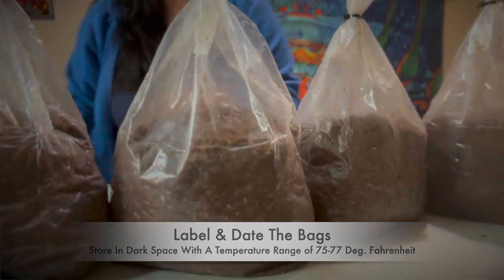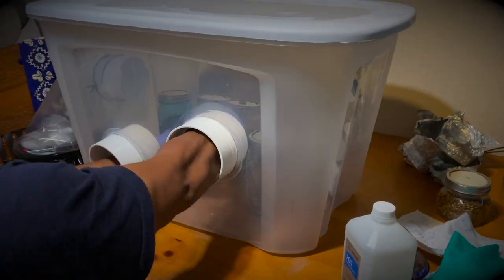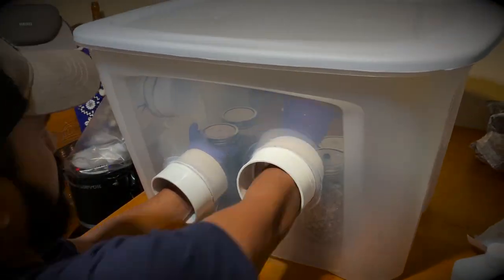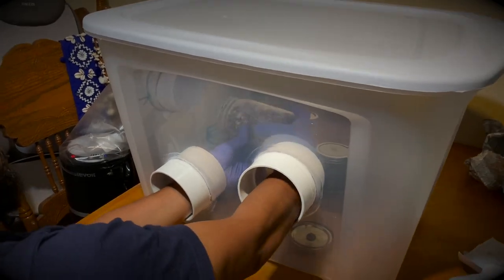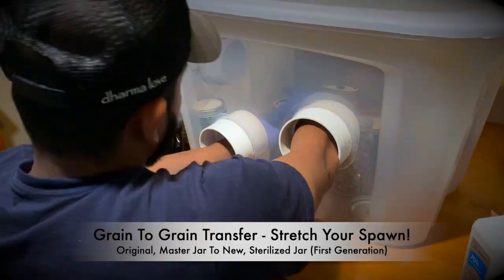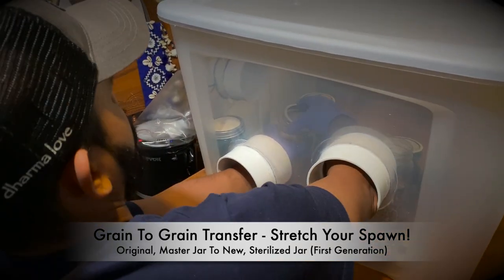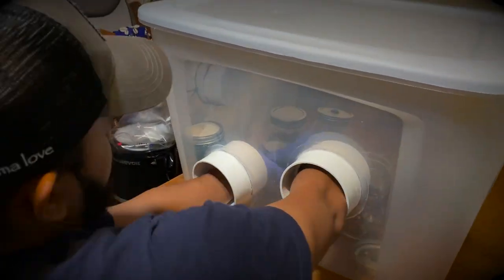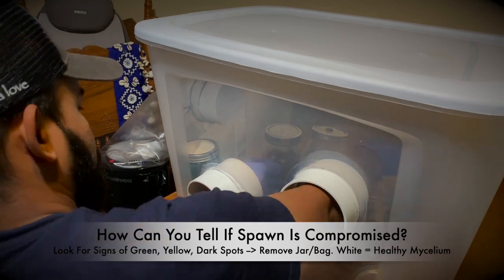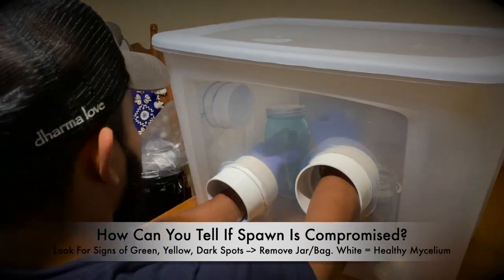Another option to multiply your spawn supply is to do a jar to jar transfer before they go into the bags. One thing to note is that this may increase the likelihood of contamination, simply because the more transfers you do, the greater the chance that some bacteria might find its way in.